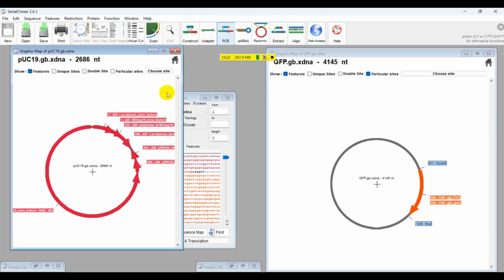এখন আমরা দেখব যে সাপোজ আমরা যে pUC19 ভেক্টরটা নিলাম, এর ভিতরে আমরা নতুন ভাবে যদি কোনো একটা জিনকে ইনসার্ট মানে করাই, যেটা কোনো ভেক্টরে ছিল না, একদম অথেন্টিক যেটা জিন, সেটাকে যদি আমরা pUC19 ইনসার্ট করি, সেক্ষেত্রে মানে কি হবে এর আউটপুটটা, আমরা কি পারবো? বা সেক্ষেত্রে তোমার যদি রেস্ট্রিকশন সাইট গুলো না মিলে, সাপোজ pUC19 এ একটা রেস্ট্রিকশন সাইট আছে, মানে দুইটা রেস্ট্রিকশন সাইট MCS এ, কিন্তু দেখা গেল যে যেই জিনটা নিচ্ছি সেইখানে আবার ওই দুইটা নাই, তো সেক্ষেত্রে তো লাইগেট হবে না, কারণ কন্ডিশন হচ্ছে যে দুইটারই MCS আর জিন অফ ইন্টারেস্টে কাটিং সাইট সেম হওয়া লাগবে। সেক্ষেত্রে আমরা পিসিআর মাধ্যমে নতুন করে দুইটা রেস্ট্রিকশন সাইট যোগ করতে পারি, নতুন যেটা জিন নিব, তো তারপরে আমরা দুইটাকে লাইগেট করতে পারি। তো we will see it in our next part.